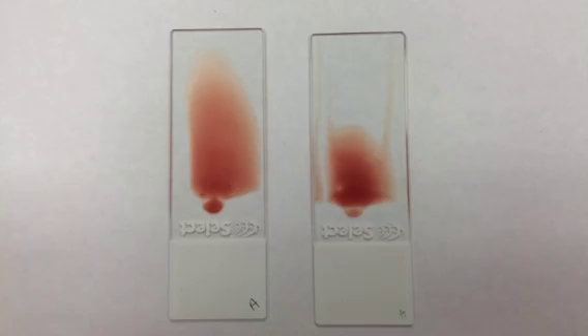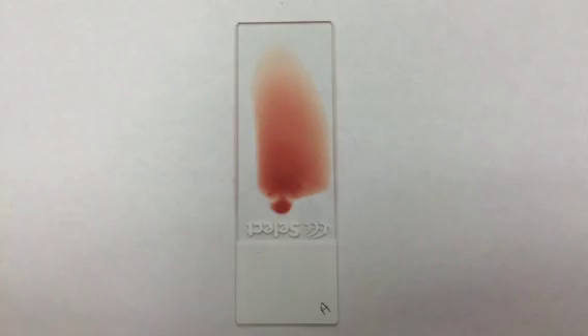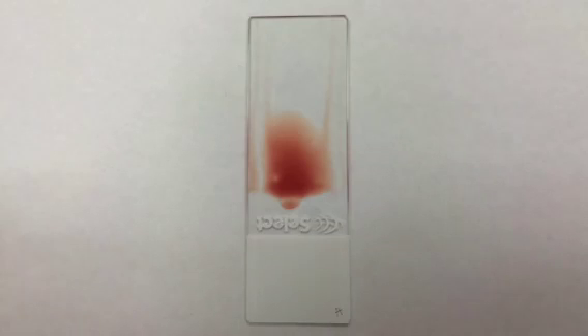The first component in blood smear slide making is angle. We want to make sure our angle is not too steep and not too shallow. The blood smear shown here was done with a much too shallow angle. This slide was done with an angle that was really, really steep.